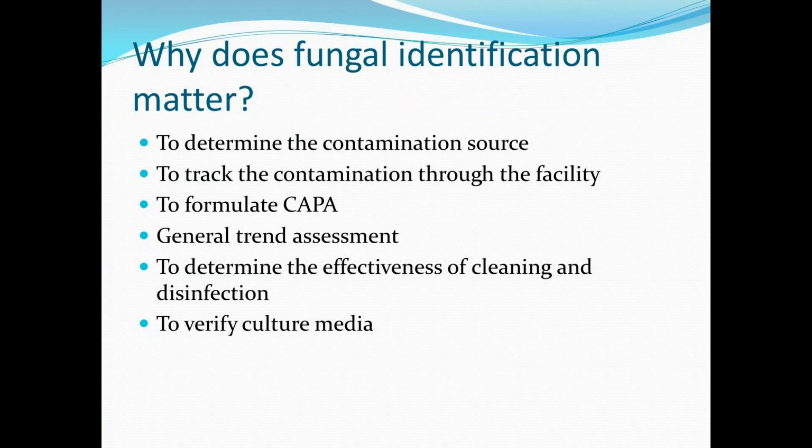Where else might this organism have been found? It allows the microbiologist to track contamination through the facility. It allows for the formulation of CAPA. It helps with trend assessments. It's quite key to determine the effectiveness of cleaning and disinfection. And also it helps with the verification of culture media. So it's probably a good idea to take some of the most common fungi and use that to challenge environmental monitoring media as growth promotion ahead of release.